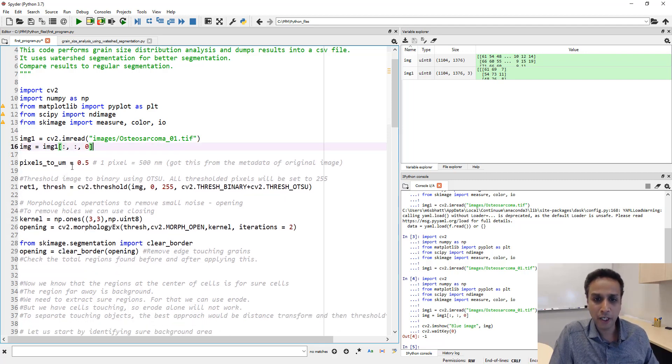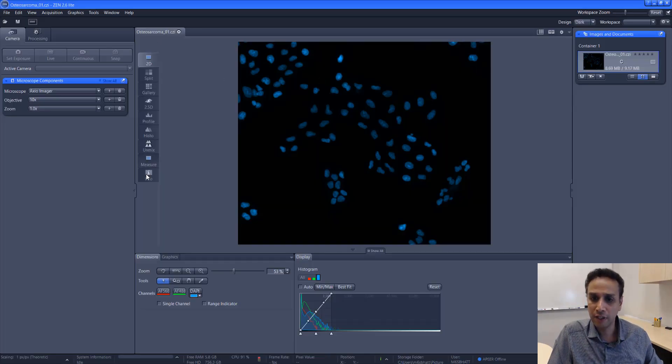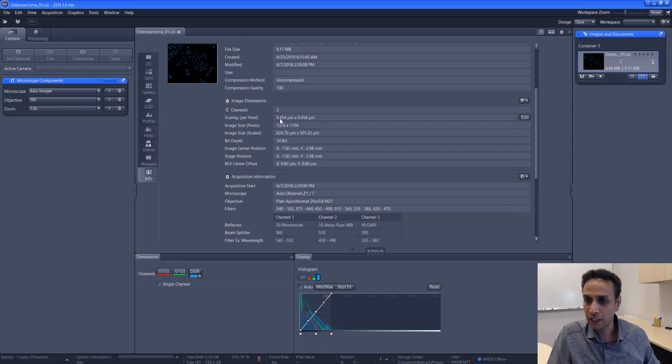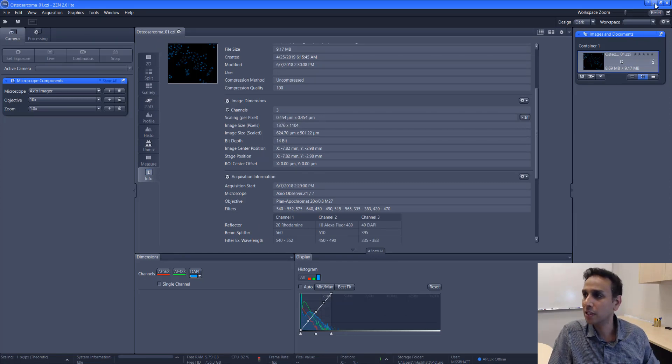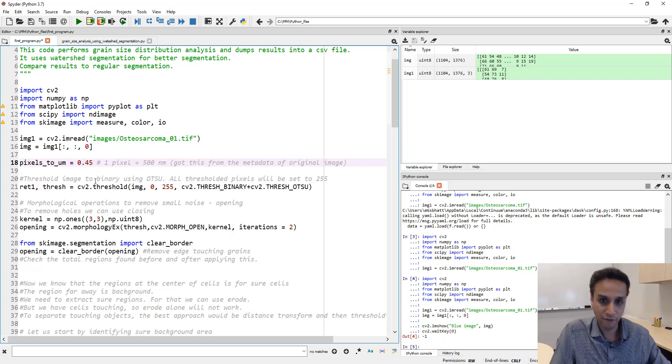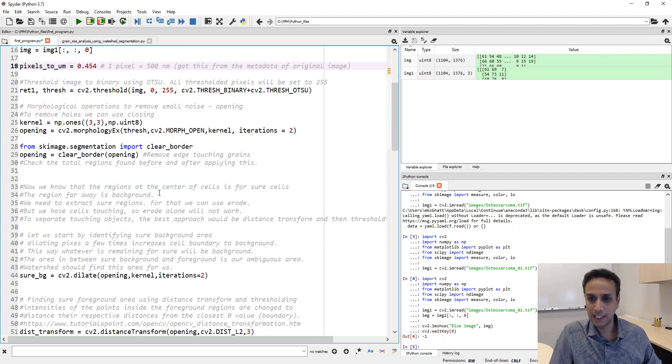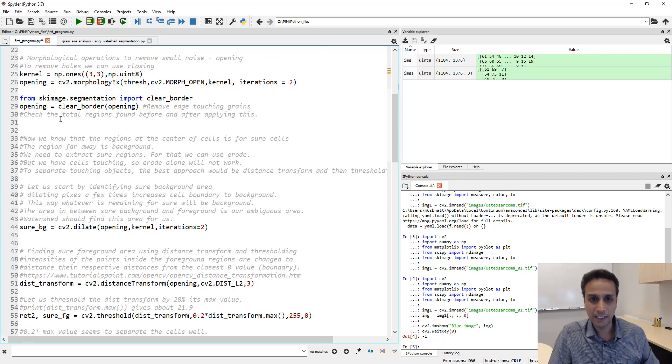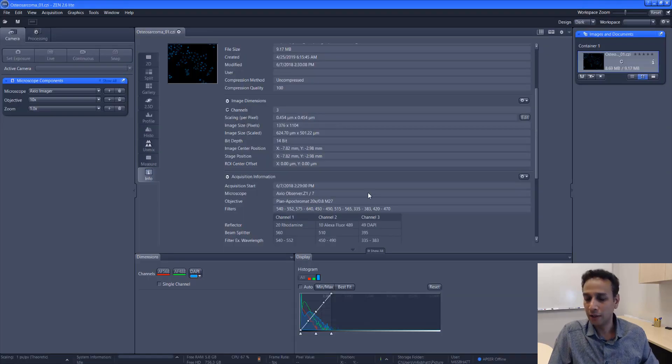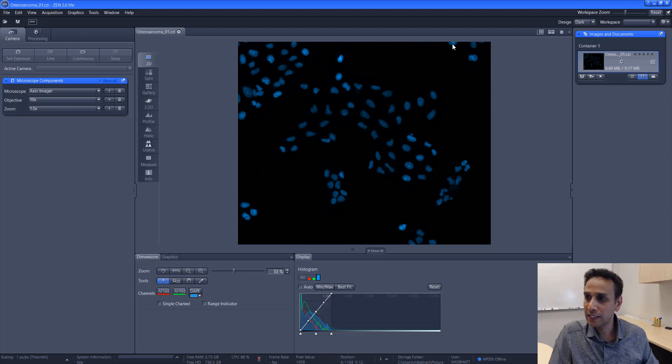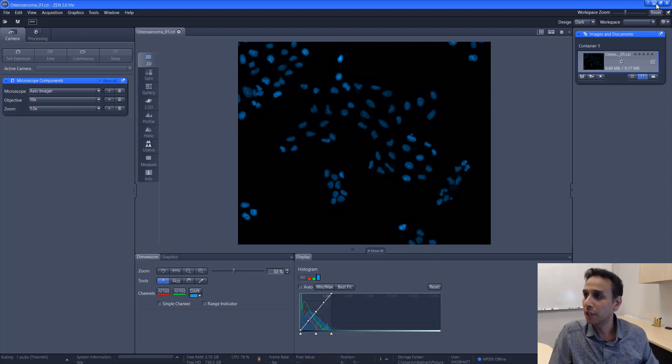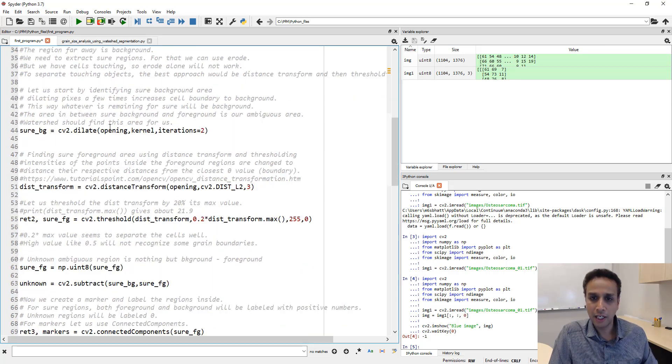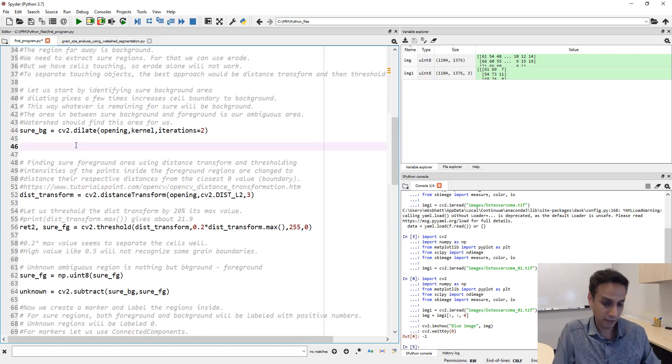Pixels to microns. What is the size of our pixel? Luckily we have full information here, the entire metadata should contain that information. 0.454 micron per pixel. Let's go back and change this to 0.454. Pixels to microns, everything else let's keep as is. Number of iterations for opening, let's keep it as is. Clear border removes the cells that are touching the border, so it's not going to include these ones as part of the calculations.